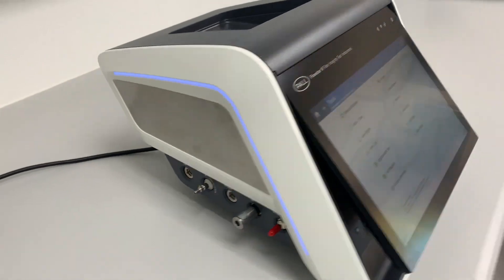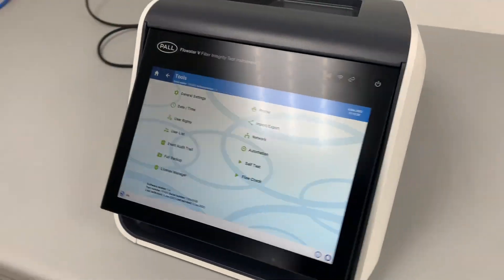Today I'm going to talk about the Palltronic Flowstar V Integrity Test Instrument. This is the latest edition offered by Pall Corporation. Like its predecessors, it has been designed for integrity testing of filters in the GMP environment.